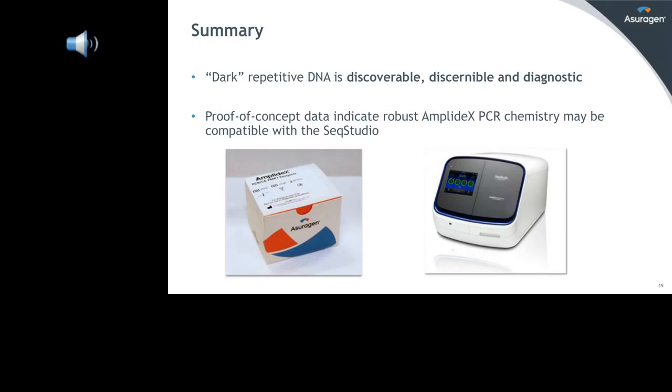So again, I think this is an area where the platform really shines because of the versatility it offers and how you can nimbly manage different sample conditions on the same plate. The standard way that one would approach the type of optimization on capillary electrophoresis would be to vary the injection voltage, the injection time, the run voltage, the run time. And so we worked with all of those variables to try to understand what were the right set of conditions for the given assay. And it absolutely depends on the assay.